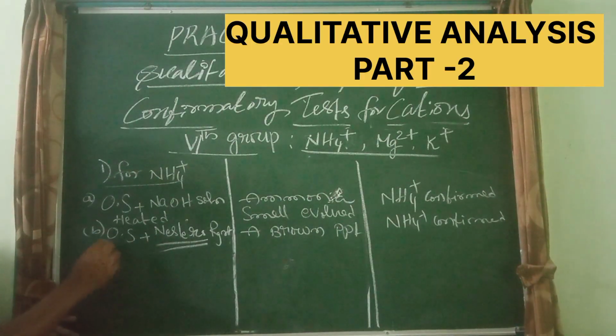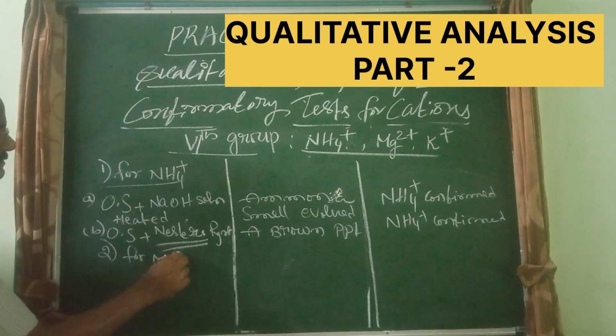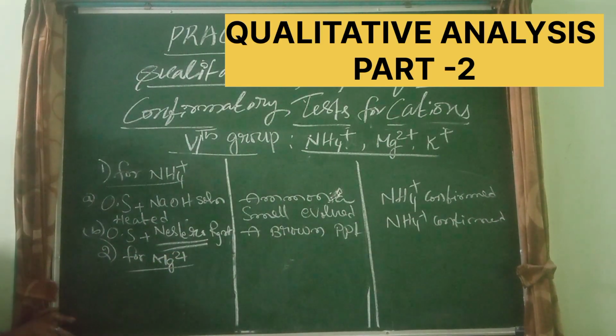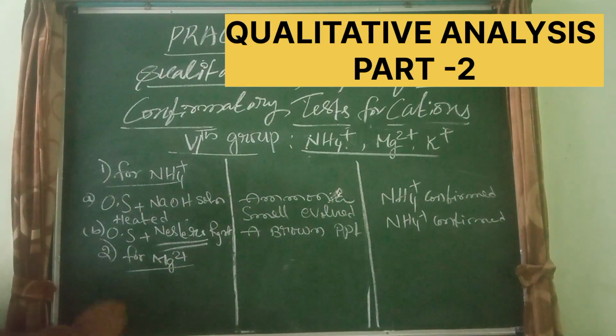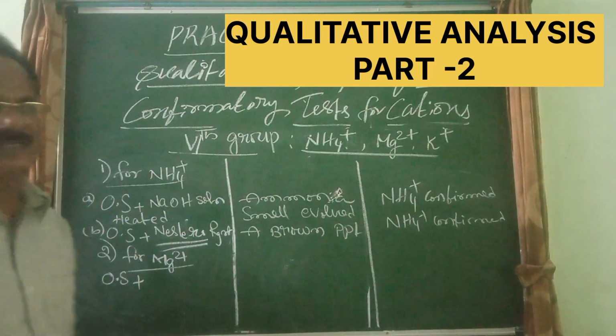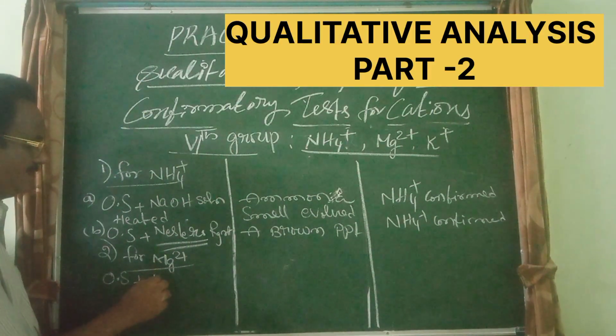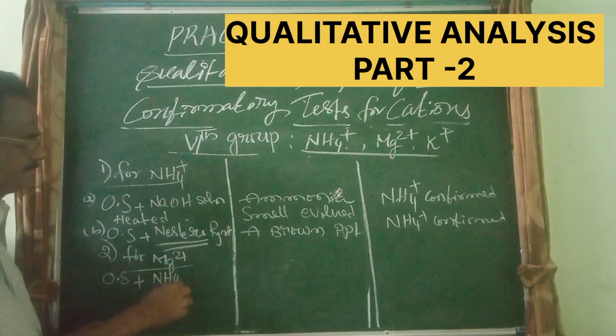Number 2, for Mg2+. This is also a simple test. Original solution, OS means original solution. I am repeating again: the original solution is added with NH4OH.